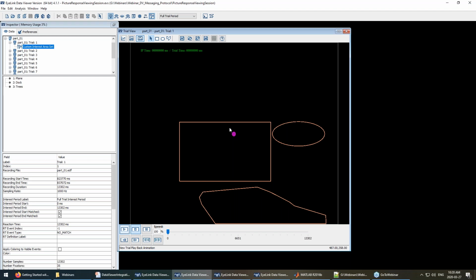They saw a picture, then pressed a key to respond to it, and it gave some feedback. So there was one image load message sent when the trial stimulus appeared, and then another image load message sent when the feedback appeared. And that's what enables us in the playback to see the experimental stimuli unfold as they did for the participant during the trial.